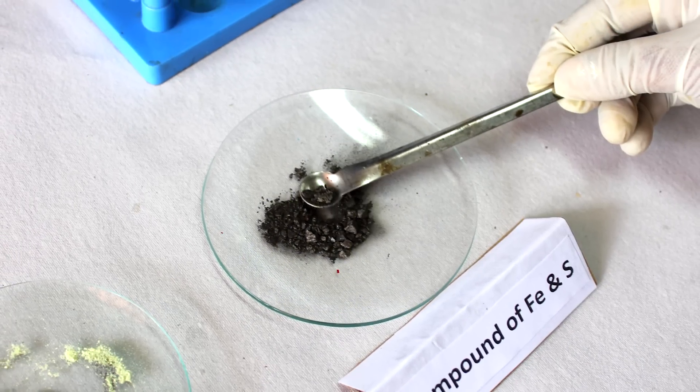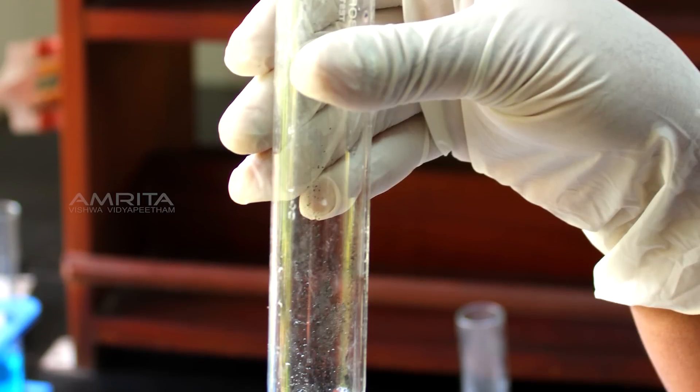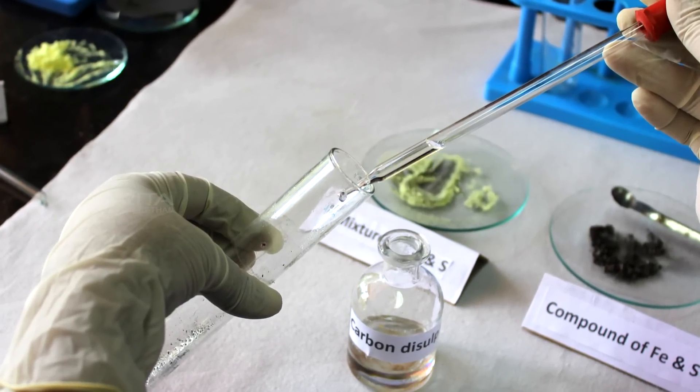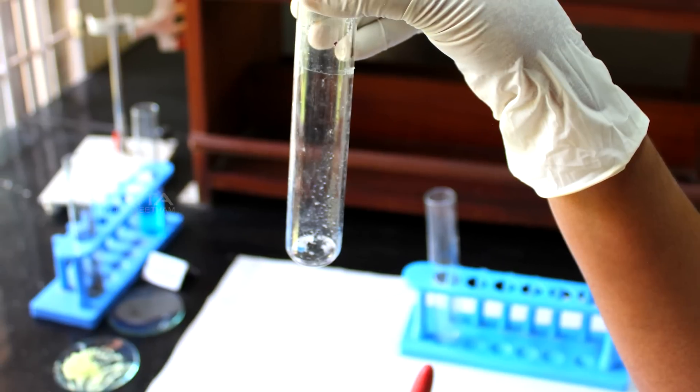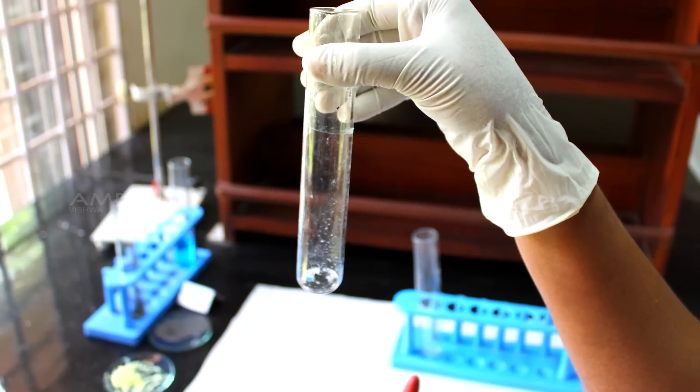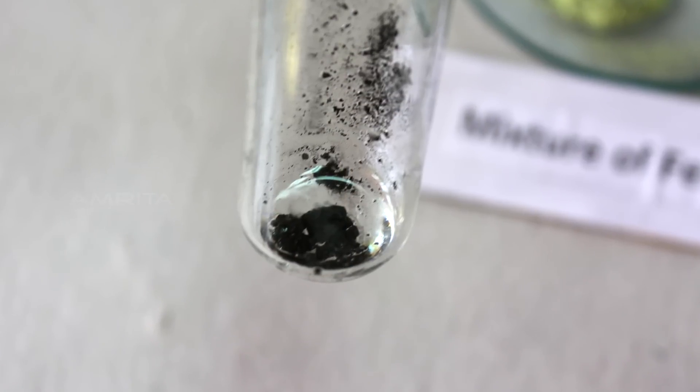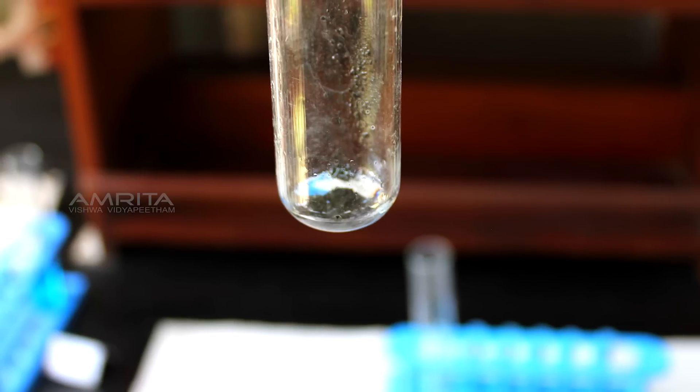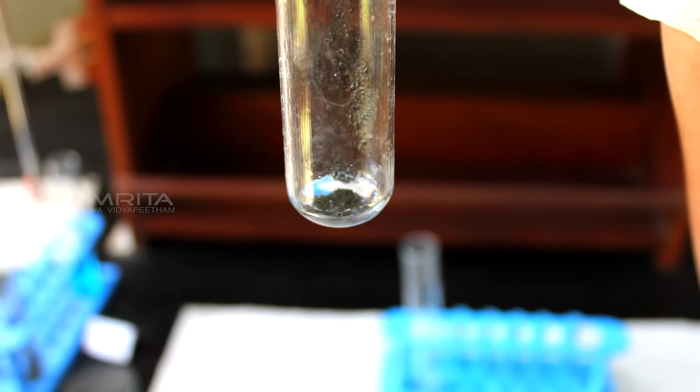Similarly, transfer a small quantity of compound to a clean boiling tube and add a few drops of carbon disulphide into it and shake the boiling tube well. Here, no change is observed which indicates that sulphur has lost its original properties after reacting with iron.